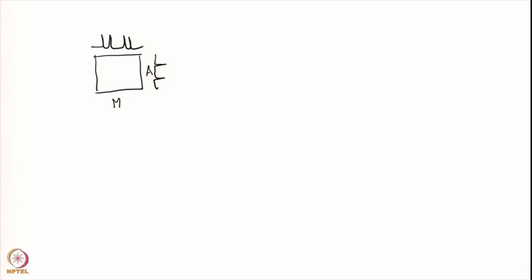Okay. So therefore each one of these there will be peaks to all the 4, from this also there will be 4 peaks here, from here also there will be 4 peaks there. So there will be a total of 8 components in this peak. This is my F2 axis, this is my F1 axis. There will be 8 components. Now what is the sign pattern here? In the case of a 2 spin system we said plus minus plus minus. How will it be here?